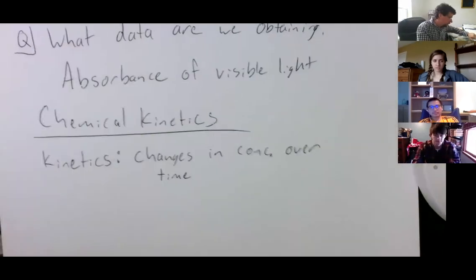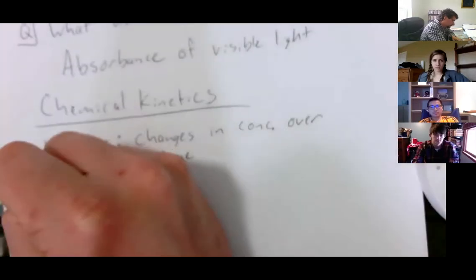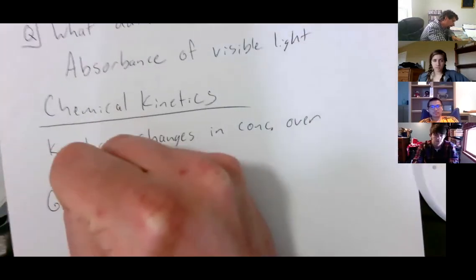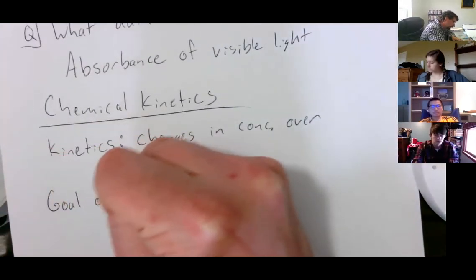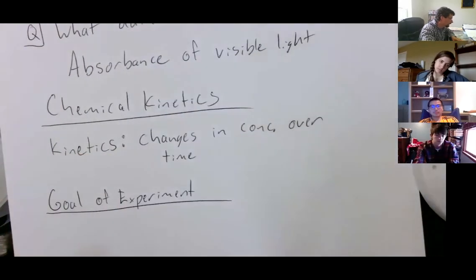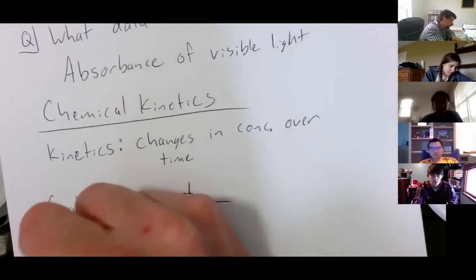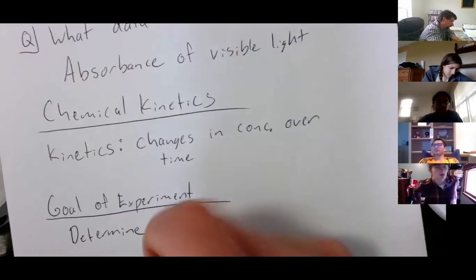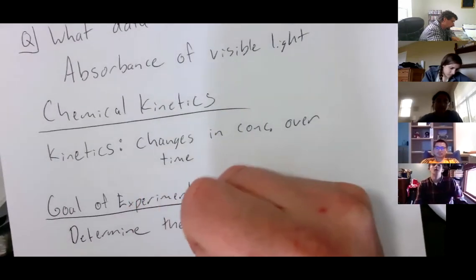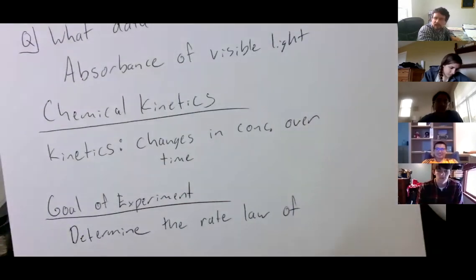All right, so what was the goal of today's experiment? To determine the rate law. Yep, determine the rate law of the reaction of what?